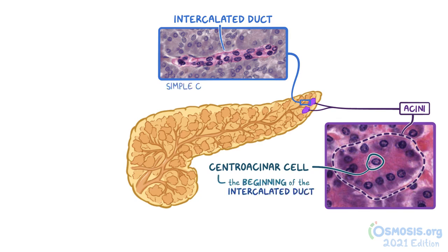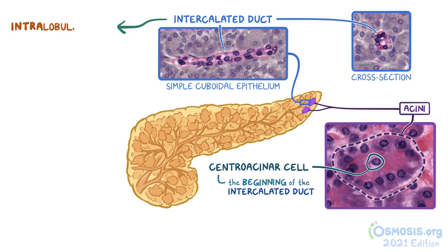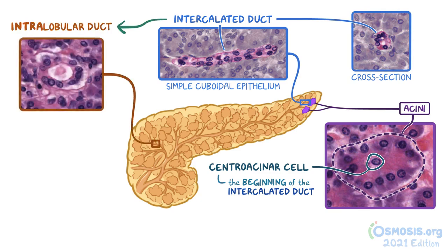These ducts are lined by simple cuboidal epithelium, and can be seen in this image as a linear arrangement of cuboidal cells. And in this cross-section of the intercalated duct, you can see the circular duct formed by the cuboidal cells. The intercalated ducts then drain into slightly larger intralobular ducts. As the ducts progress, they gradually increase in diameter, and the connective tissue surrounding these ducts also thickens.